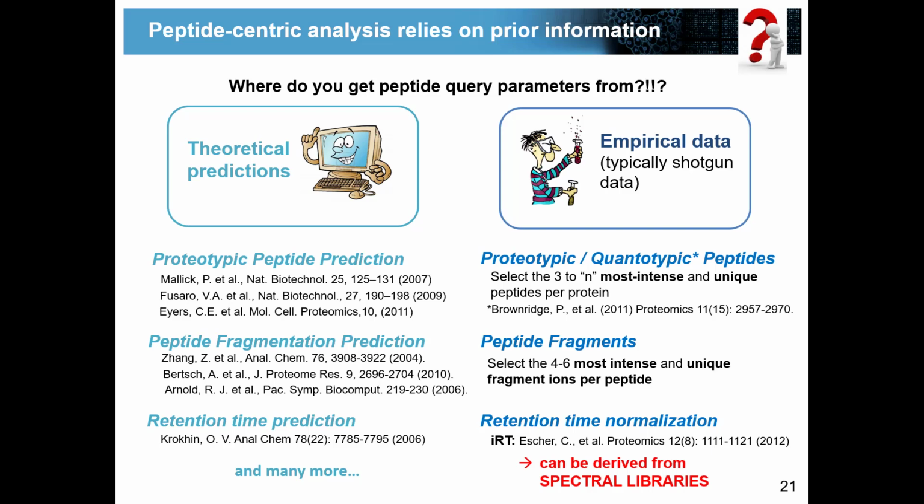You can also work with isotope labeling. Whatever type of isotope labeling, you will go up with the number of transitions. Again, everything goes by 2 if you look at several channels. So it's really a trade-off of things that you can do. That's also why there are 3-2 something, 4-2 something. It's a balance that you need to find for your project.